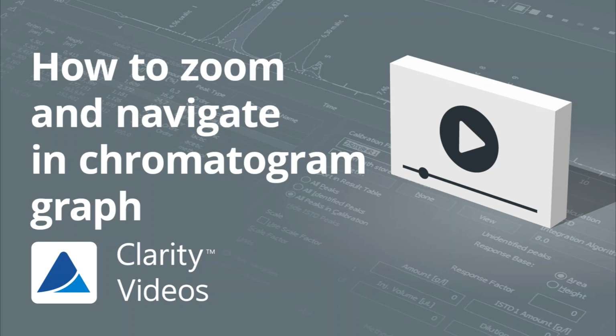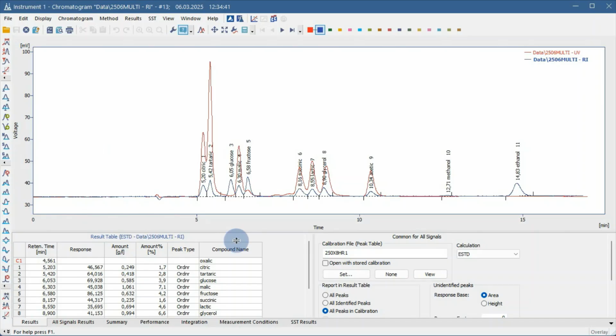Hello. In this video, we'll show you how to navigate the chromatogram graph using zoom functions, and how to stay oriented using the preview graph. There are several ways to zoom in Clarity. You can use the mouse to select a part of the graph you want to see, or use keyboard shortcuts.